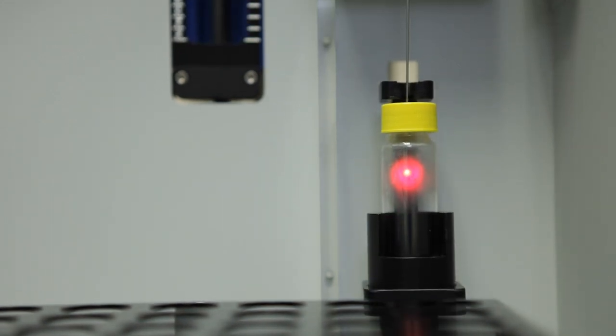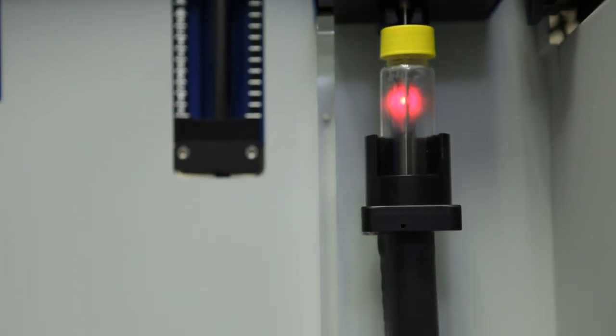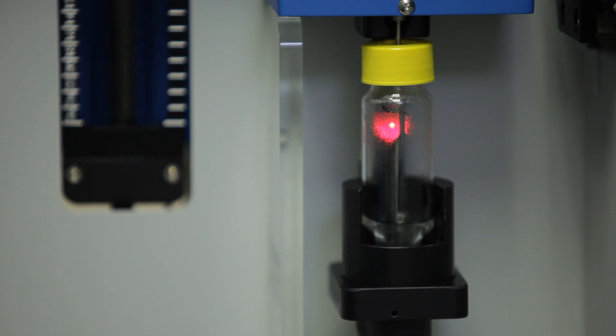Once the SEPTA is pierced, a programmable volume of blank water with the internal standards is added to the vial. Vials are then purged in place and the analytes are transferred directly to the sorbent trap.